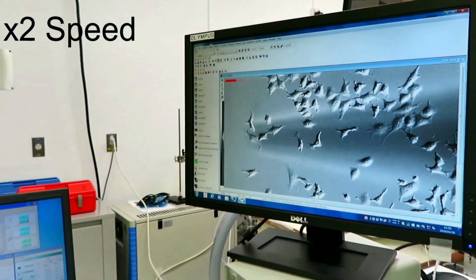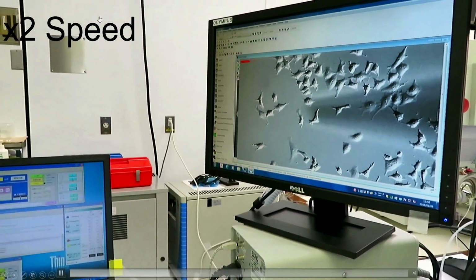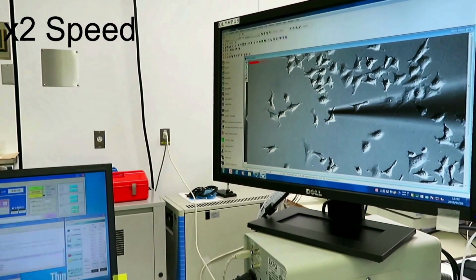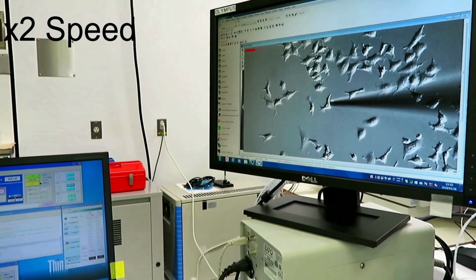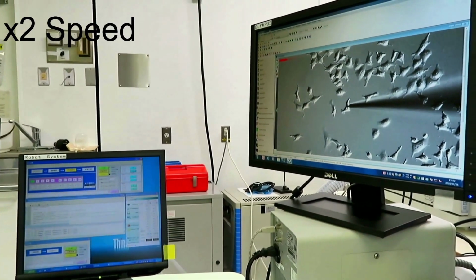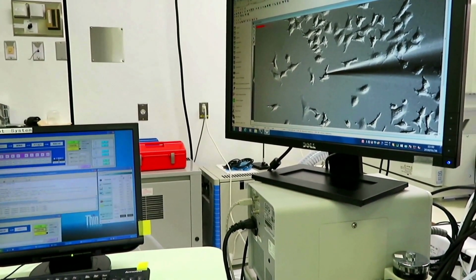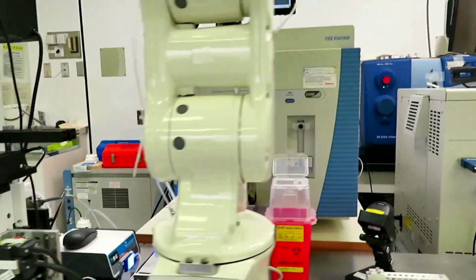What you see here is also sped up a bit. We can control the robot via a kind of primitive GUI, to be honest, on the left. You move it up and down, left and right, etc. Once you have your cell, you push a button, and then it picks it up. Not fully automated yet, of course. This is just our second attempt. After it picks up the cell, which will happen, maybe it will be too fast now. Let's see. Yep, too fast. After it picks up the cell, it goes to robot number 2.